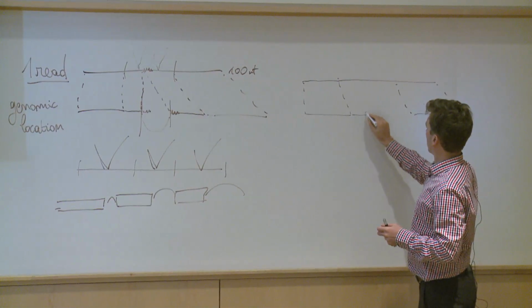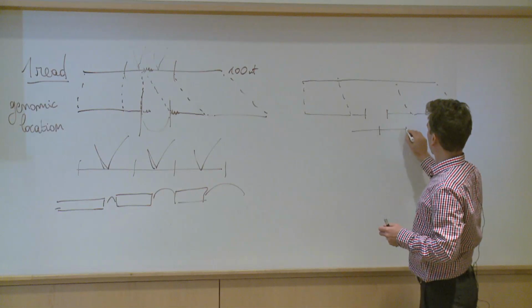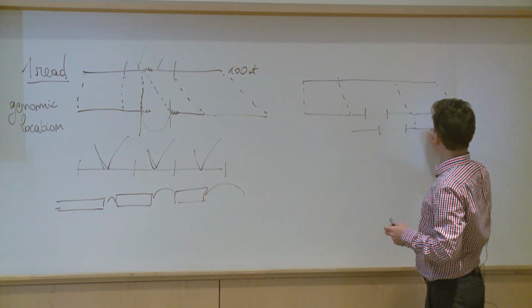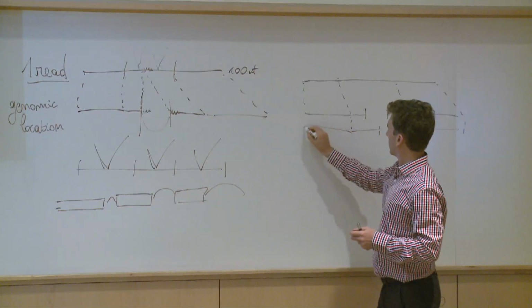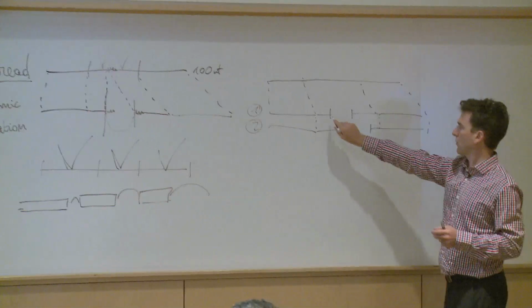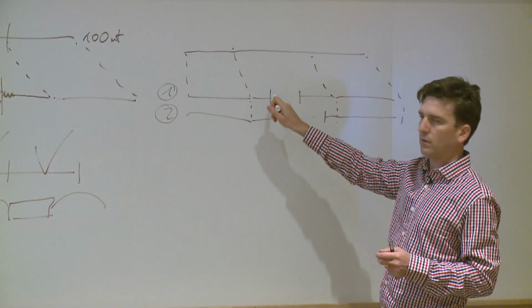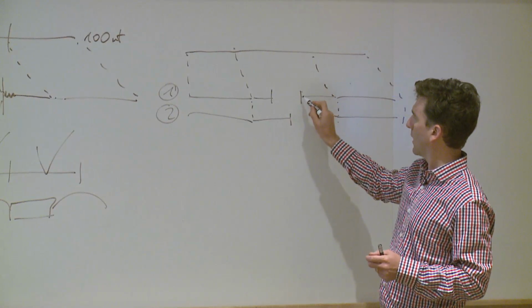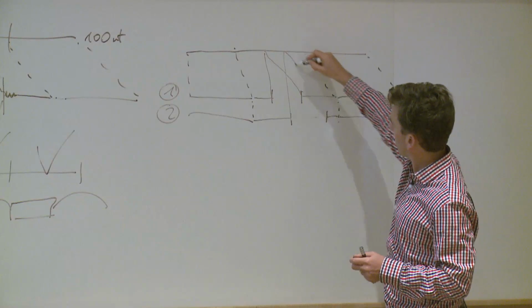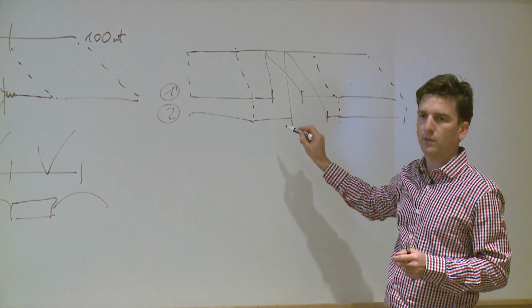Out of this one, you can have this or that. So you might have 2 different locations for the splice junction. When you extend your read, maybe this part will map and then that part will map, and you'll have a junction like this, or you'd have that one, and both are equally good. You see what I mean?